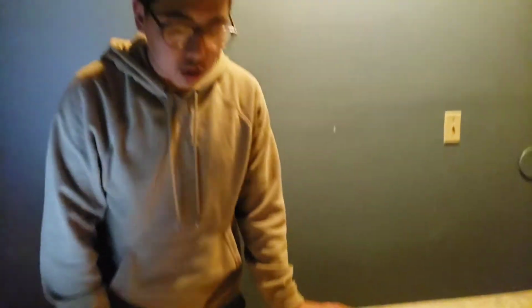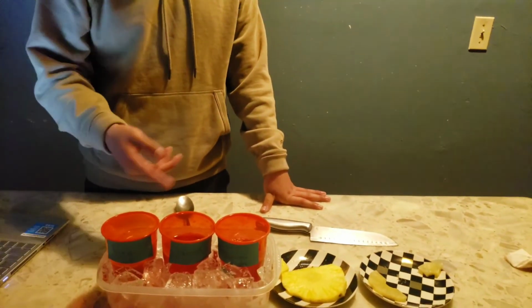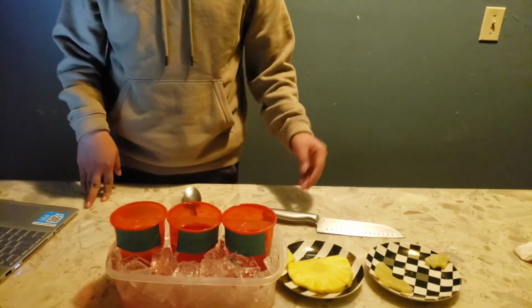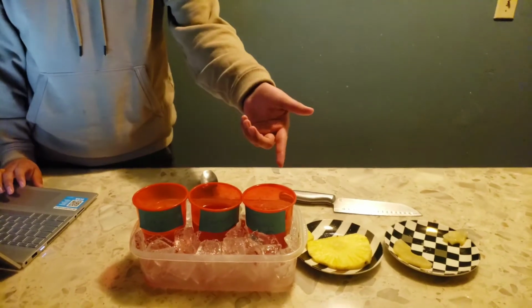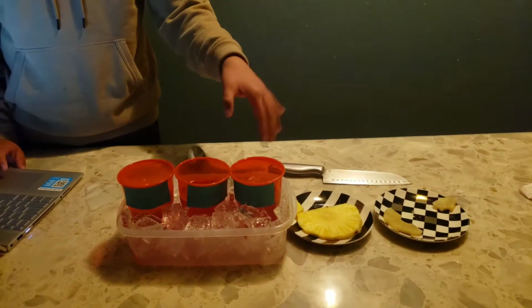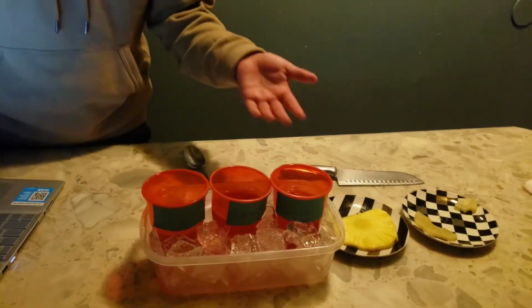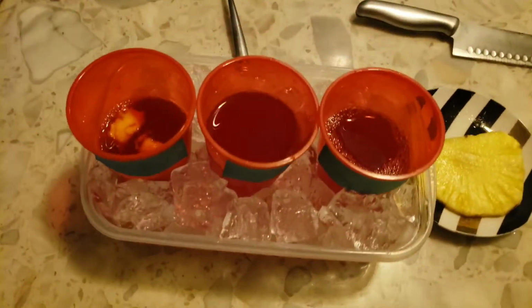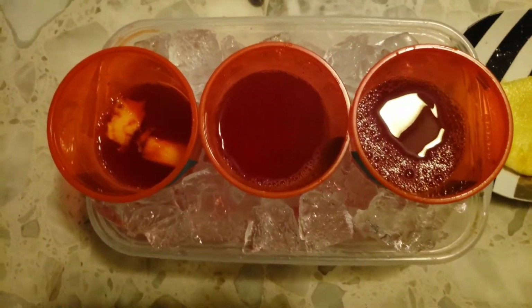So for the data table, under 2 minutes, I will input that the fresh pineapple is floating, while the canned pineapple has already sunken. And the control, which would be the no pineapple, has no reaction because there is no pineapple. There's no enzyme within the solution.